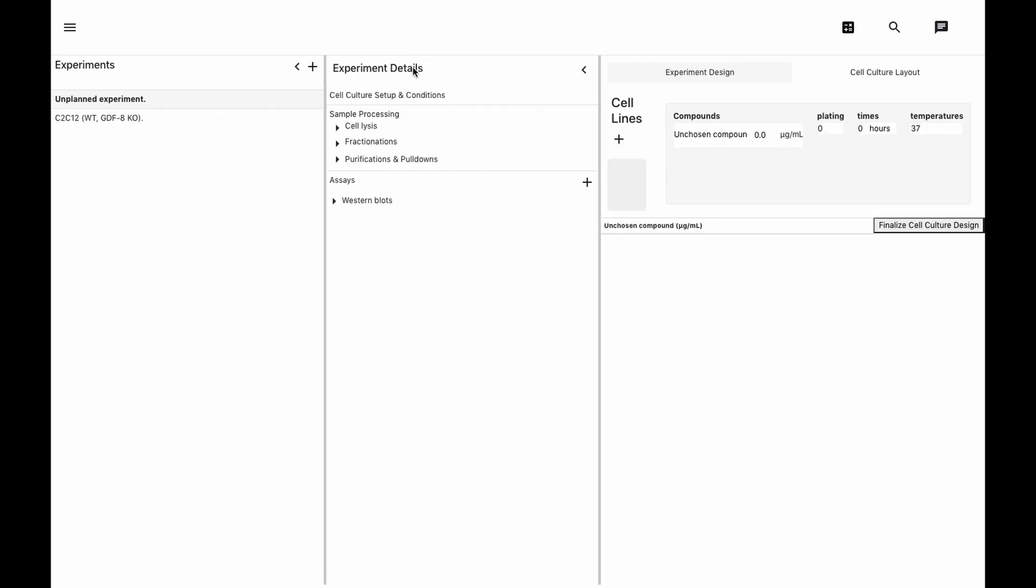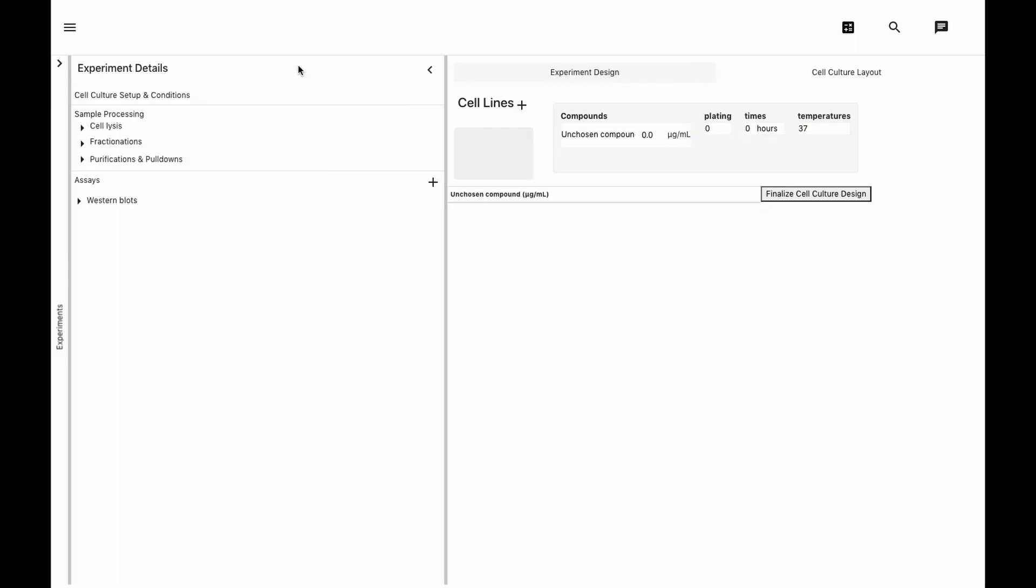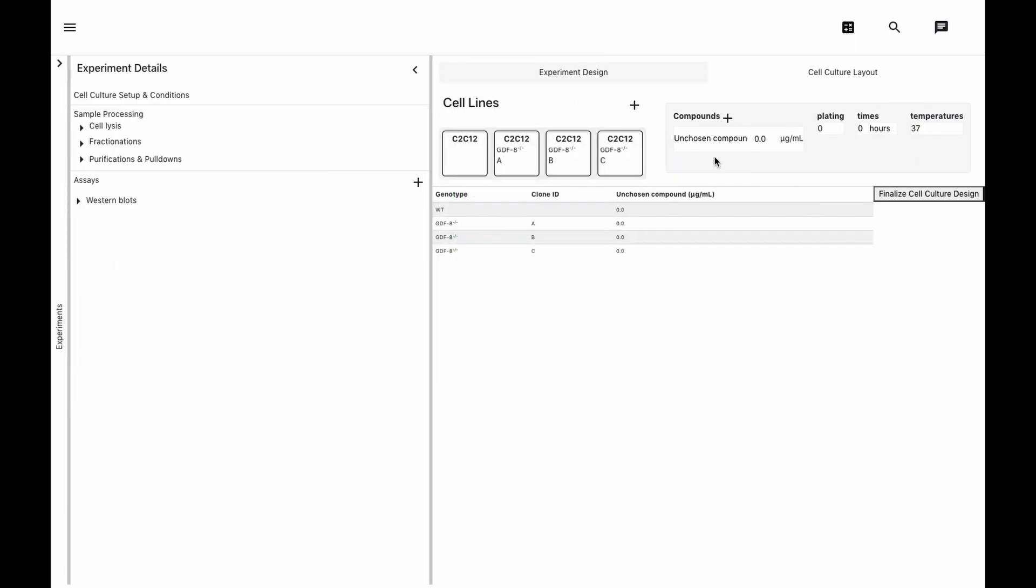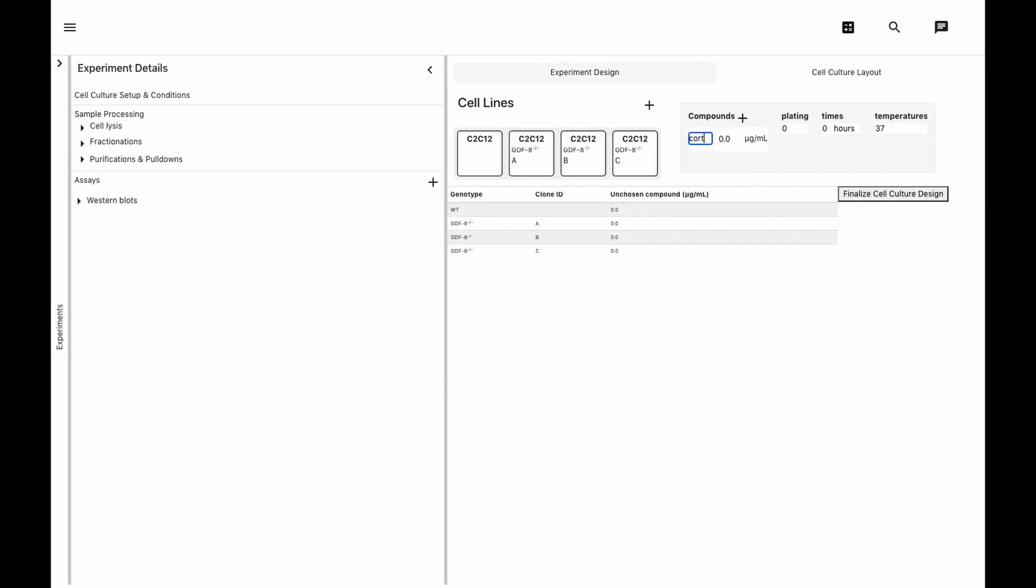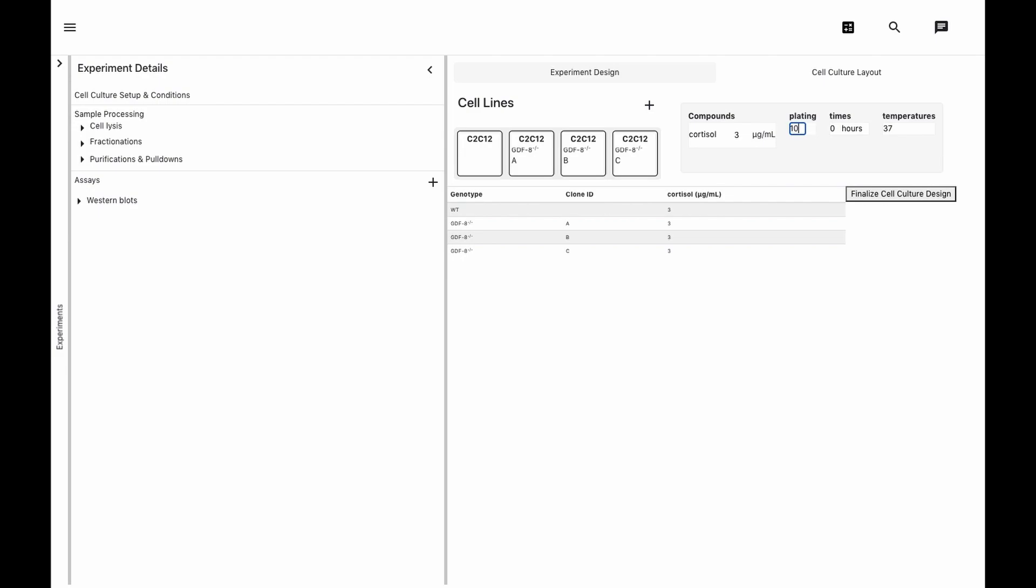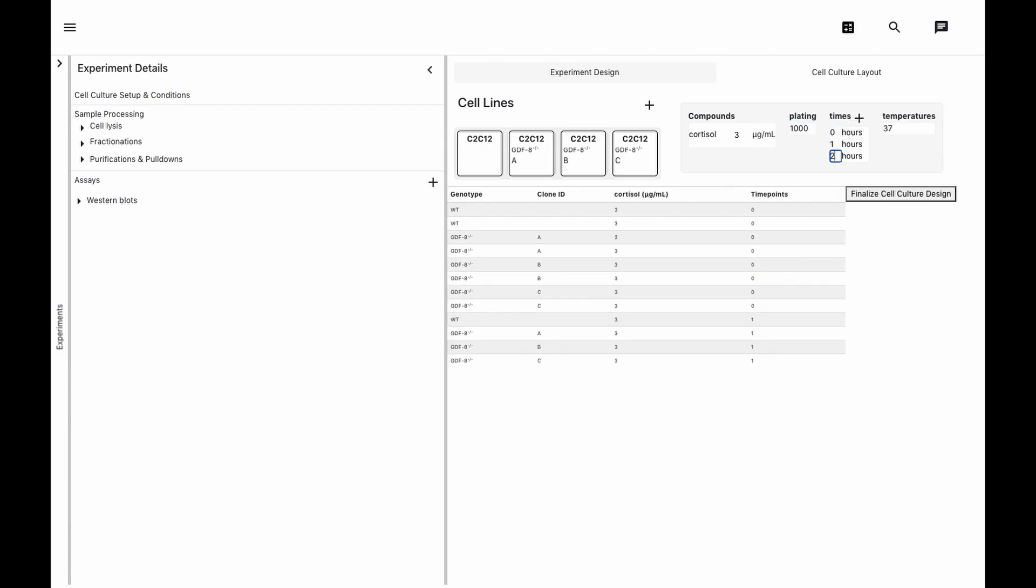We'll start by creating a time-course survey of cortisol's effect on C2C12 and knockout clones. Notice how the table below expands the summary we're filling in now into the individual samples created from the experiment.